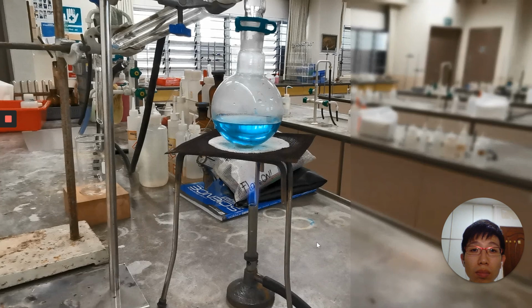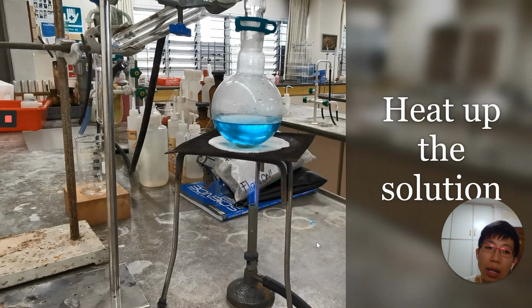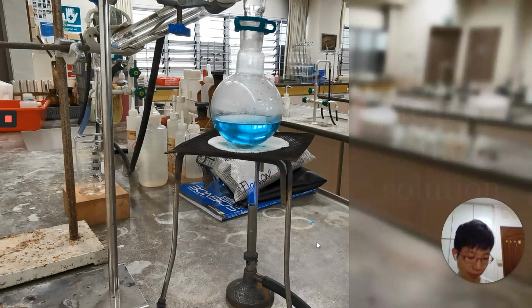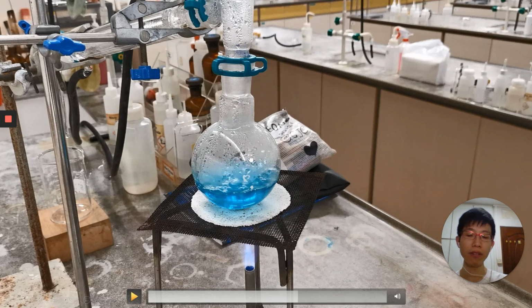Okay, so now we're trying to heat up the solution. And we are using a copper 2 sulfate solution over here. That's why you get the blue solution due to the copper 2 ions. And water is evaporated in this part over here. And you notice that it has been evaporated into steam or water vapor, as you can see in the top part of the distillation setup.